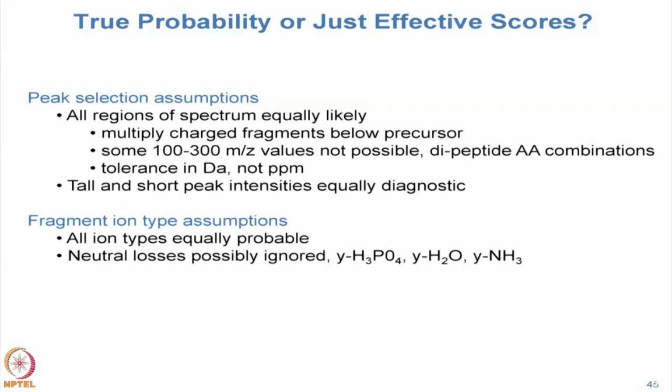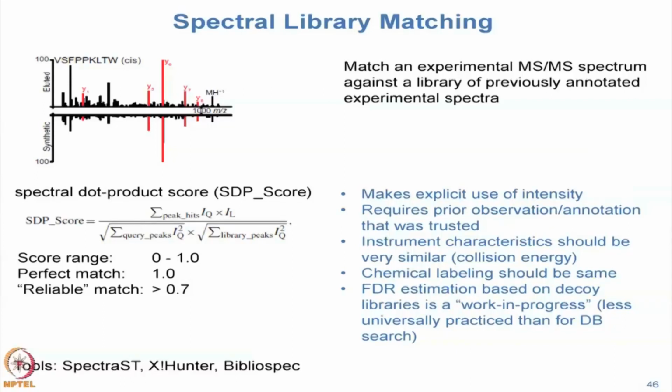Now what I want to show you here is a contrast. This is what you would do if you knew what that peptide fragmentation was going to look like. Okay? And you would know what the spectrum is going to look like because you already had a spectrum that you trust and is used as the reference, presumably because you knew you had the peptide, maybe you made it synthetically, generated a spectrum, that spectrum is put in a library, and then all the experimental spectra you generate, you just match to the library. Okay? The particular case that I'm showing is one where somebody is trying to demonstrate that the thing they observed in a complicated experiment, they made the synthetic peptide, the spectrum looks almost the same, you can calculate a spectral similarity metric, and it passes the threshold, and they can say, see, this is what we said it was. Okay?